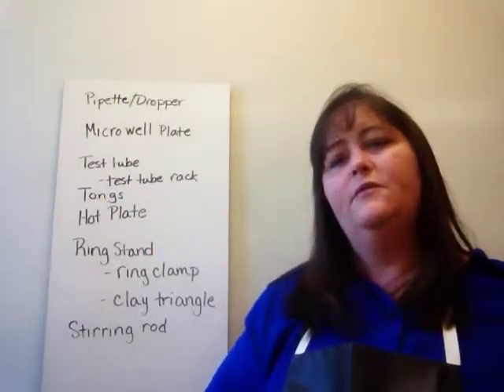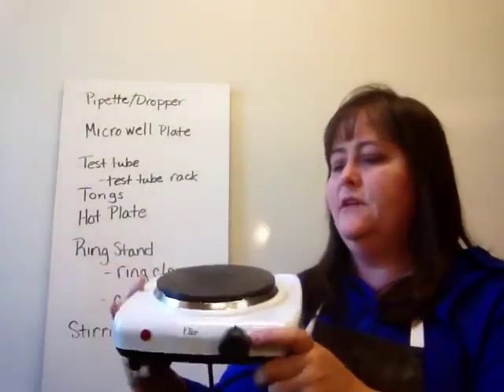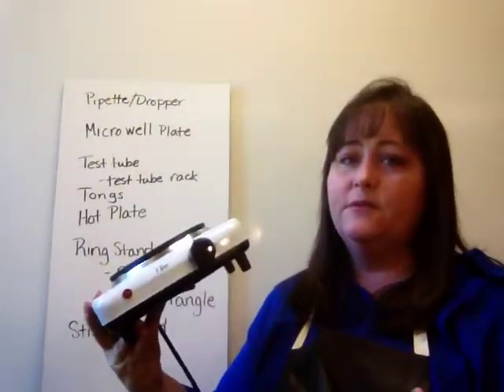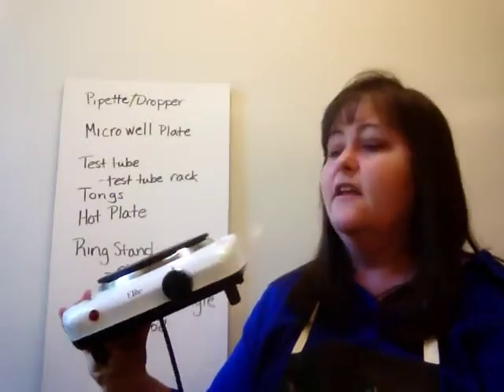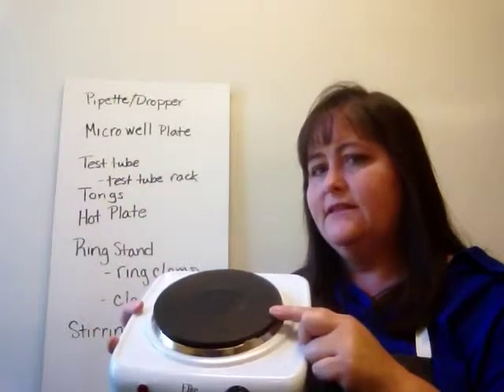That's the next piece of equipment that you need to be familiar with. Now, hot plates are sort of dangerous because they're plugged into the wall. Of course, if we spill water on the electrical outlet, that's not a good thing. So you got to be careful around them. But also because you can't tell when this is hot.